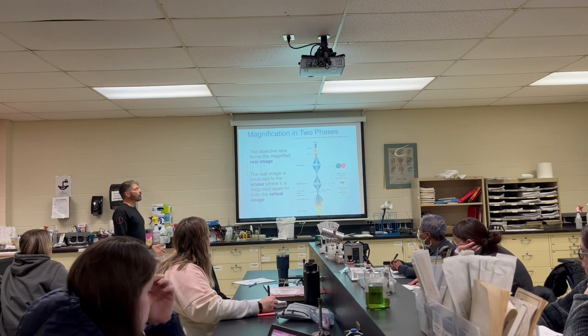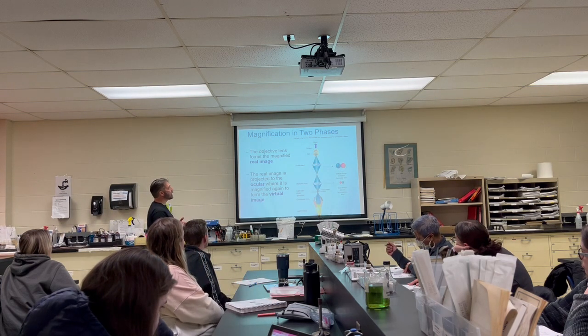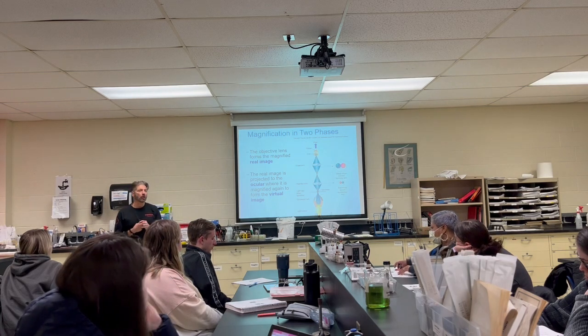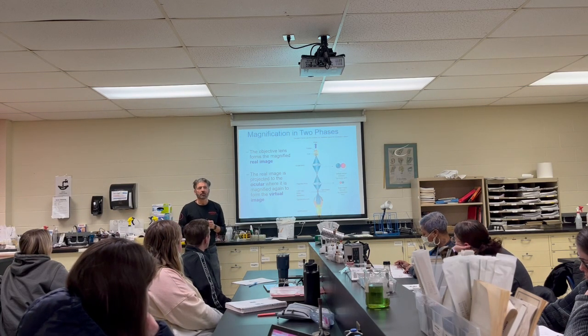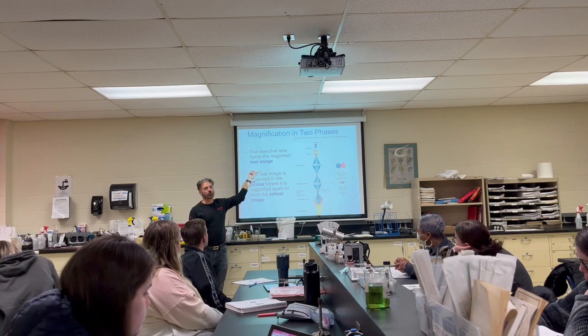All right. So they could ask you a question in the future about the objective lens forming the magnified real image. When I say objective lens, how do you think they come up with that name? Because it's next to the object. It's the objective, all right? And the eyepiece or ocular is where you put your eye in.